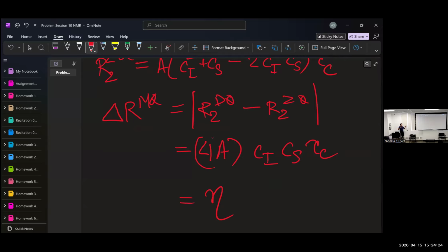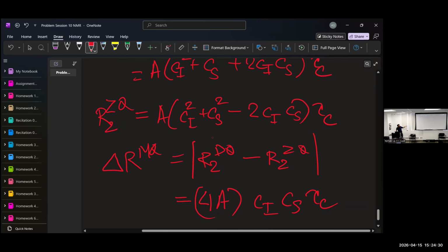So those are the two, and for the N15, it's a really strong effect. It's very analogous because there's also cross-correlated relaxation. But you access it by studying the differential relaxation of the nitrogen coherence when protons spin up versus when protons spin down.